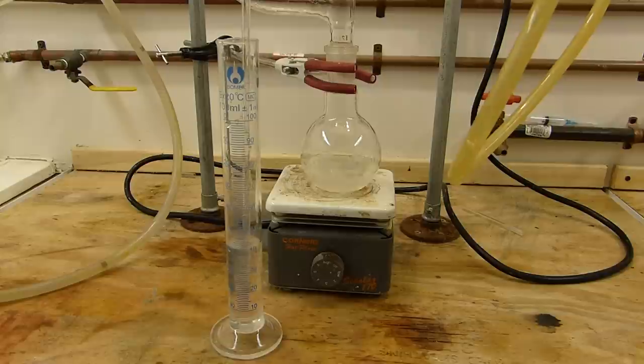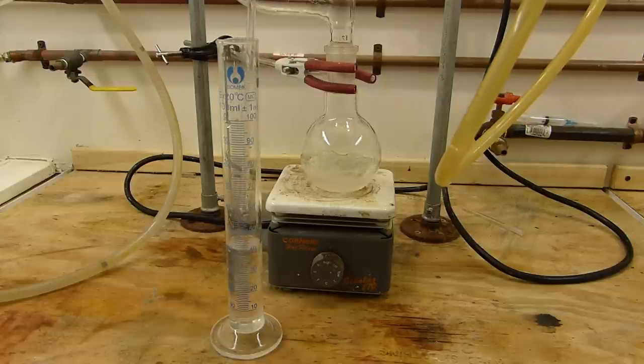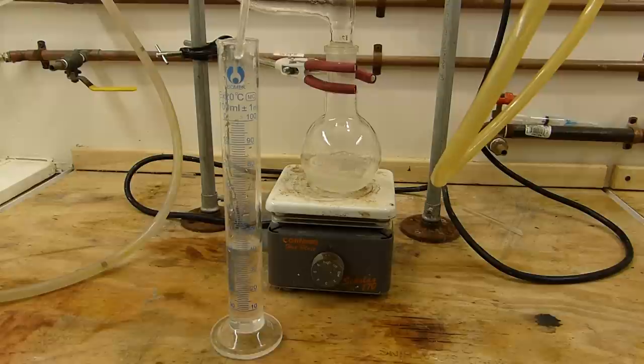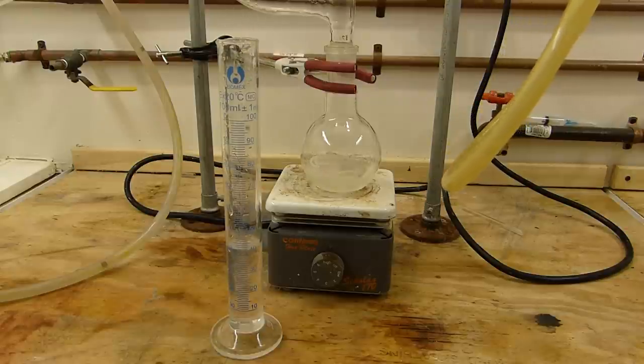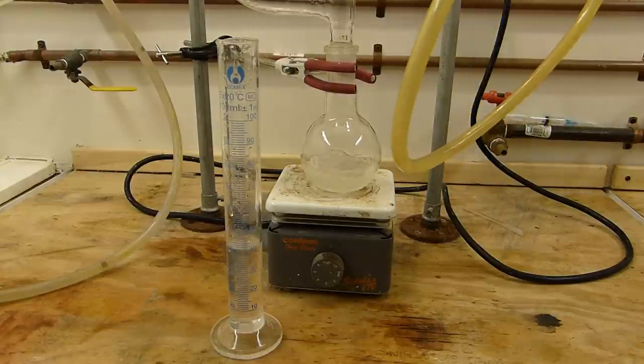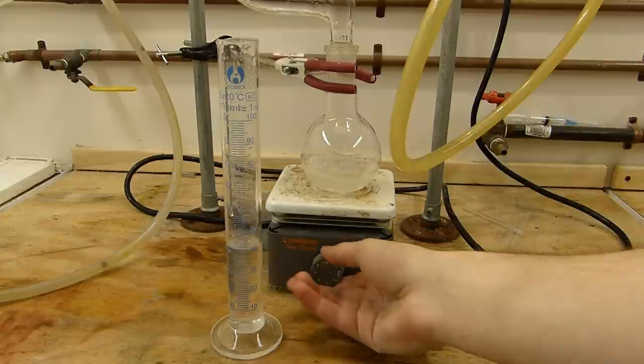You can see when gas generation starts to taper off, it'll start to climb the tube here. So we can simply pull it out, and this is just about done. We'll pull this out and leave this tube in a safe place somewhere in the fume hood so that we can pull the excess ammonia out and turn off the hot plate.